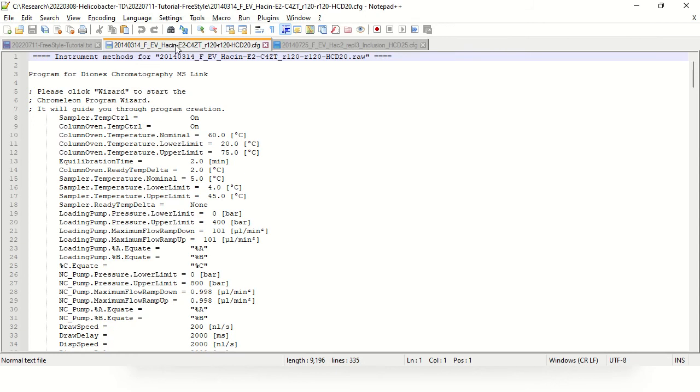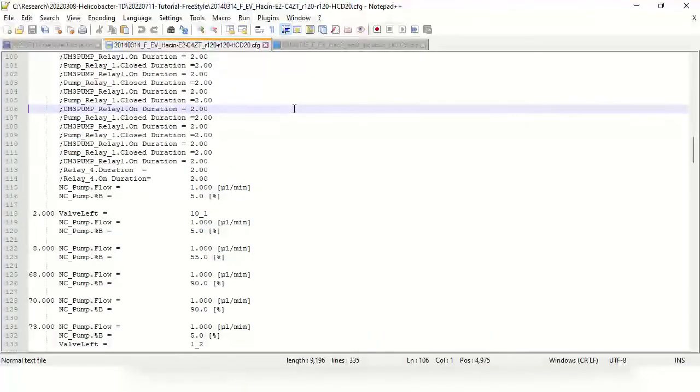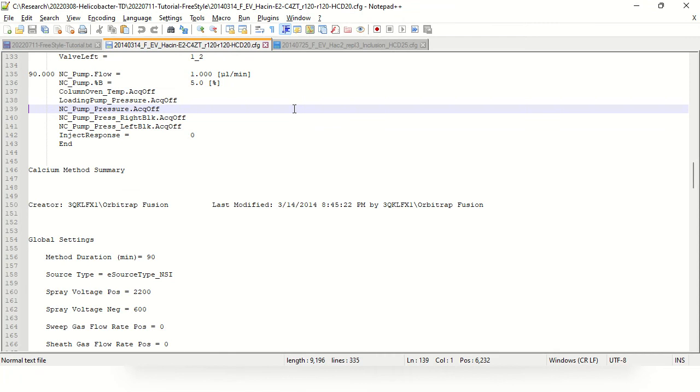So if you're accustomed to looking at mzML files, you would probably realize pretty quickly that a lot of the information found in these configurations does not appear in the mzML file. So it's important to remember that a raw file contains piles of information above and beyond what appears in an mzML representation of it. So this is our effort to capture more of that information through Thermo Raw Meta Dump.